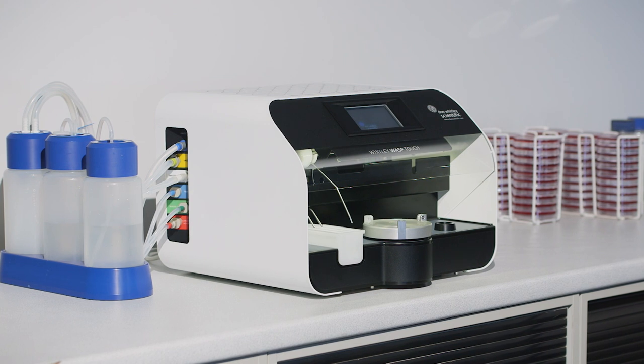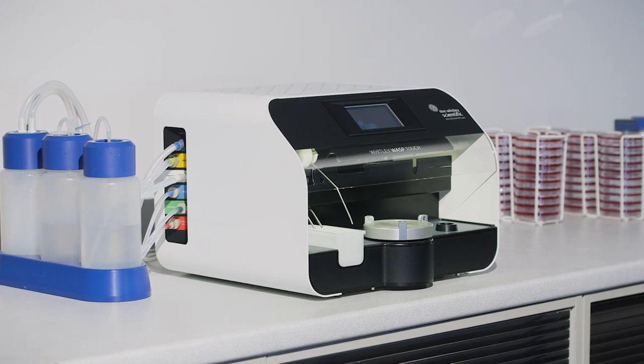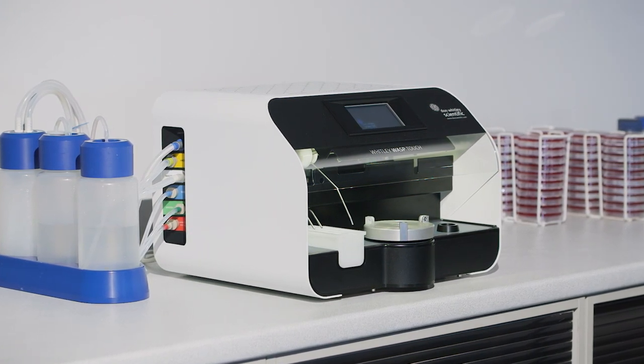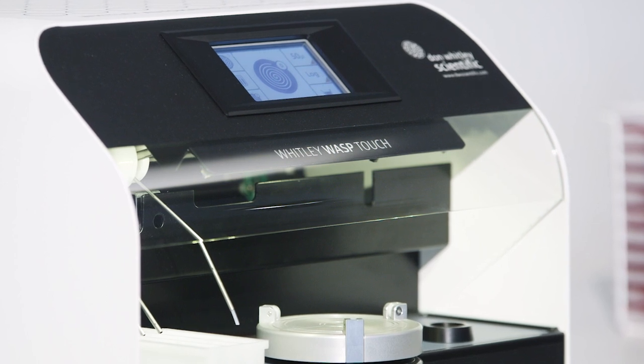Don Whitley Scientific presents Wasp Touch, a spiral plater designed for today's busy laboratory with touchscreen control and enhanced functionality.